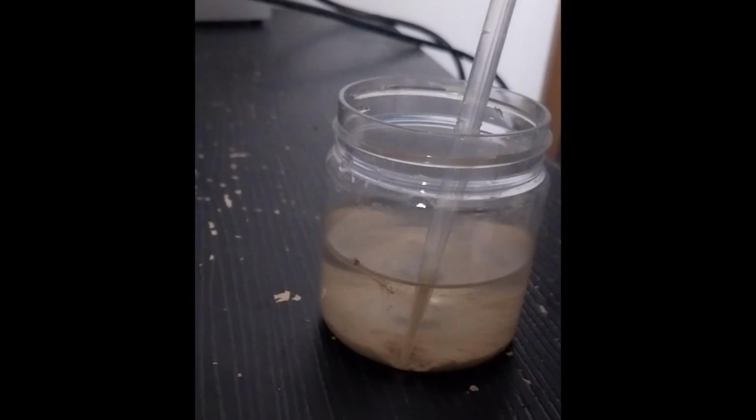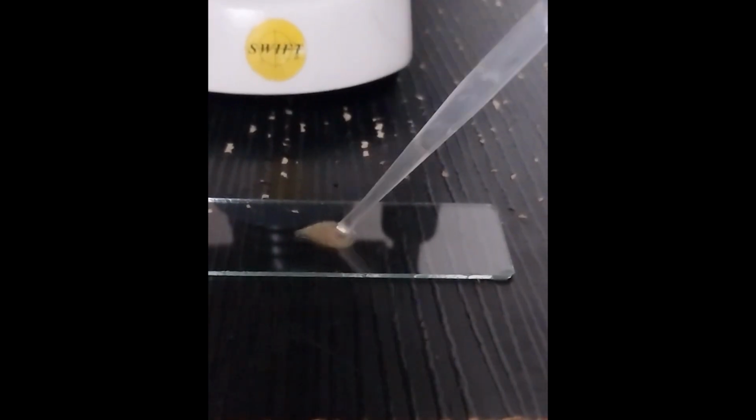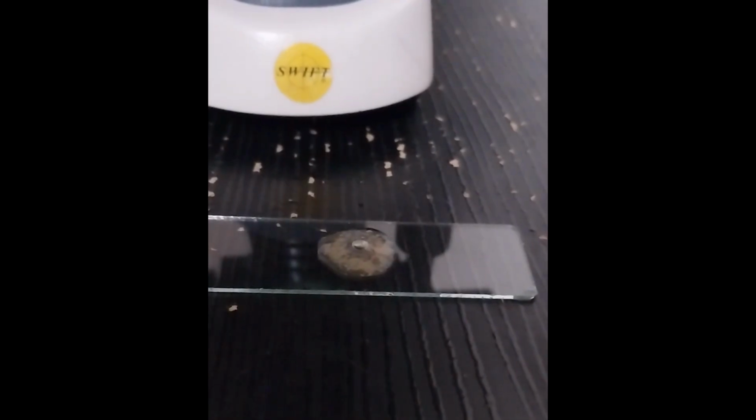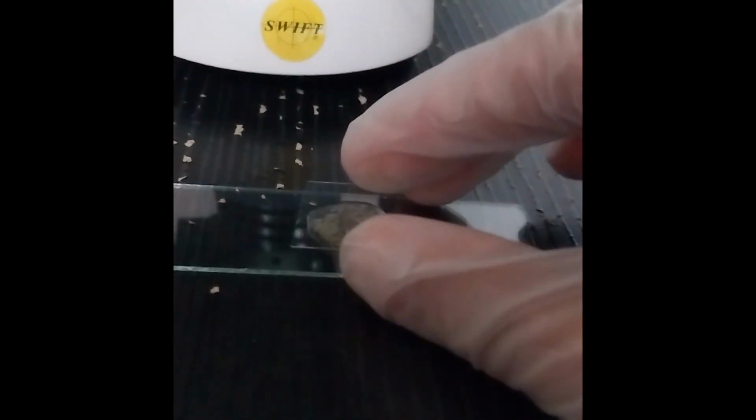Thirdly, this rounded diatom. Diatoms produce a significant portion of the Earth's oxygen. Next, let's take a look at some of the sediment under the microscope. I only put a small amount of sediment, because it separates between the slide and the cover slip, allowing microorganisms to swim out of focus. So, putting a small amount helps reduce this space and keep microorganisms in focus.